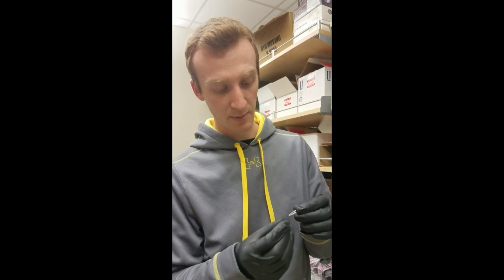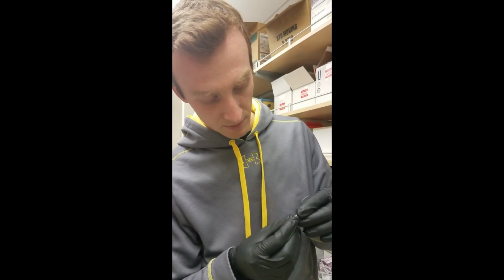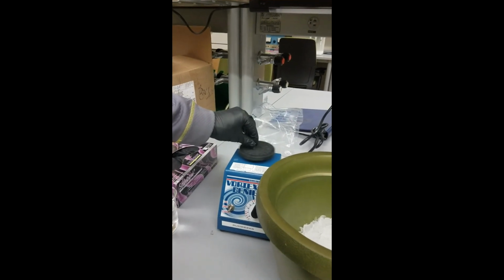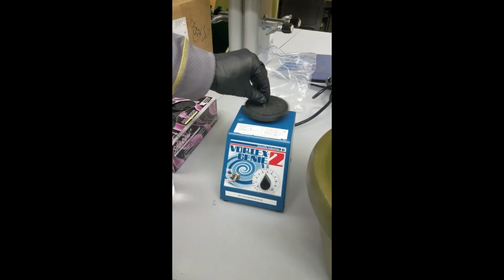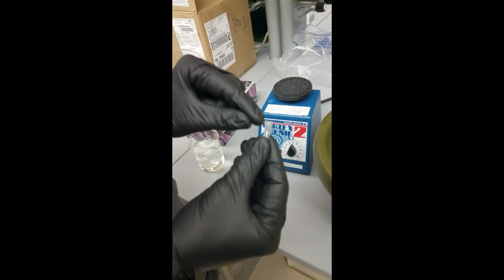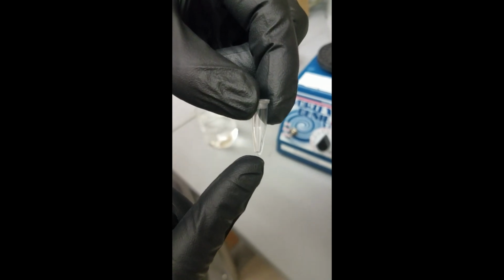First thing you do is defrost it, so just hold it in your fingers for a few minutes, it doesn't even take a minute, and it'll defrost pretty quickly. Just keep track of it. There you go, it's already melted. You want to vortex it for just a minute to make sure that it's all suspended. Now, ours looks good, but sometimes if the RNA ends up in the cap, you'll have to centrifuge it back down to make sure that your droplet of RNA is in the bottom of the tube. Now we're going to go use this, put it back in the ice.